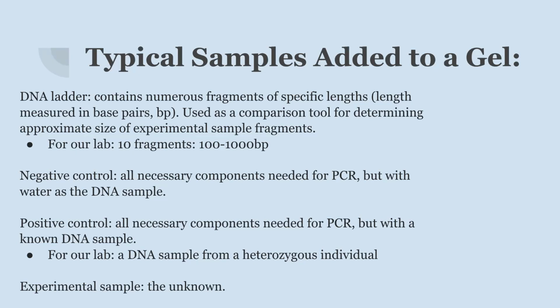Because if we see lines on that negative control part of this assay, then we are going to know that our samples are contaminated and we cannot interpret the results, right? Because we should not have any results at all in that segment. And if we do, that means that contamination has happened.